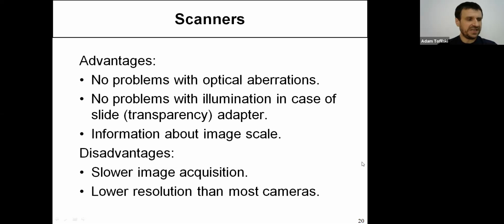Scanners also have disadvantages because they are much slower than cameras. With a camera, you have a fraction of a second and you get the image, but with scanners, usually it takes much longer. There is a noise and you wait. Sometimes with high resolution it can be even a minute before the image goes to the computer.